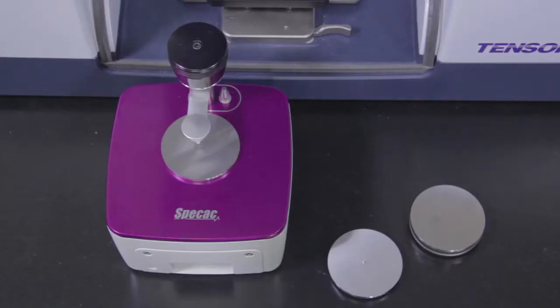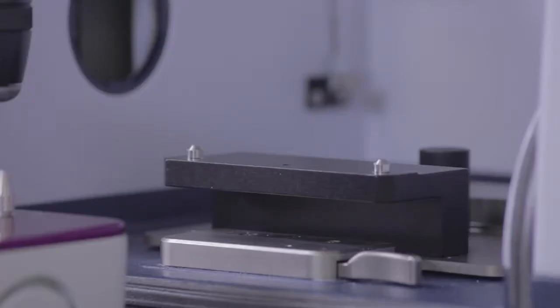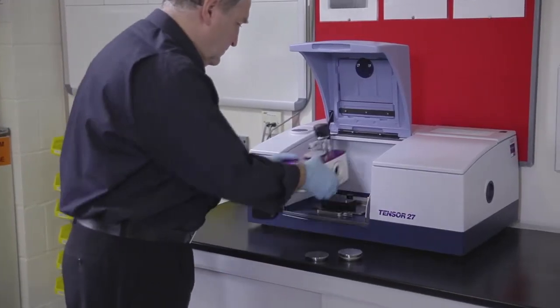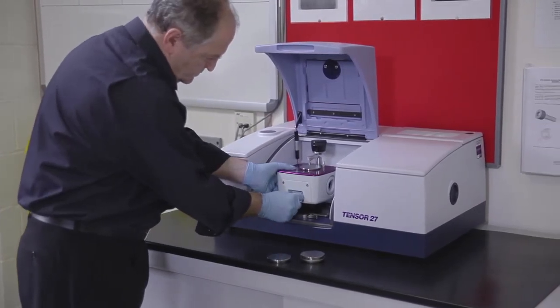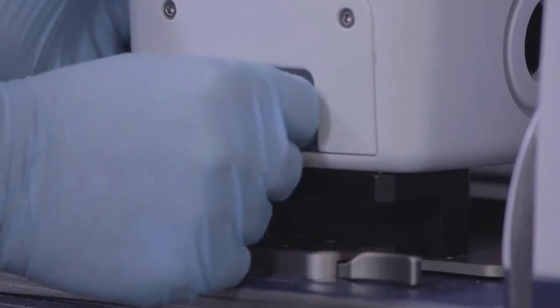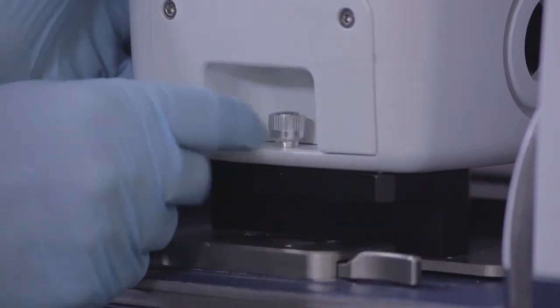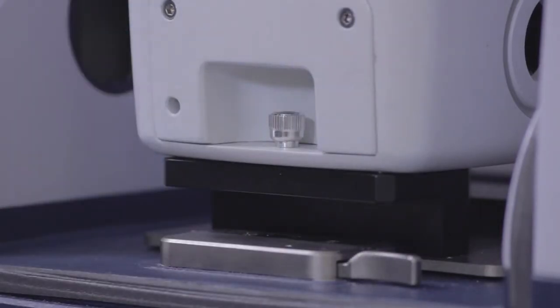The Quest ATR accessory is compatible with SPECAC's benchmark base plate system. This means the Quest accessory is not limited to use in a particular spectrometer but can be quickly and easily fitted to a range of modern spectrometers with the use of the appropriate benchmark base plates.